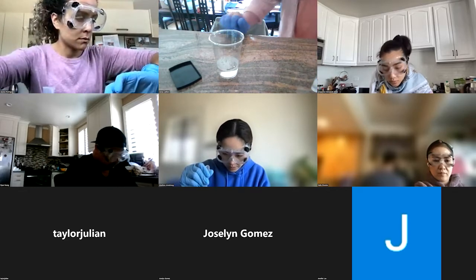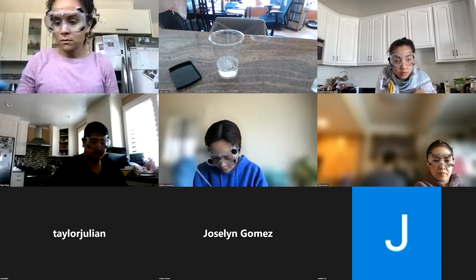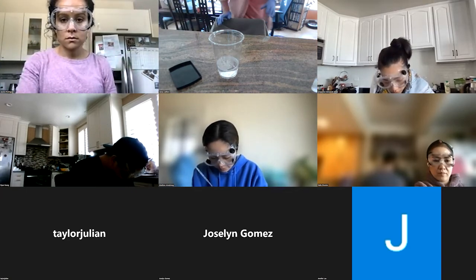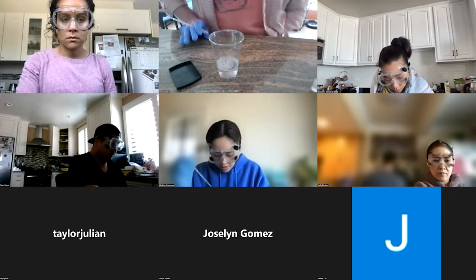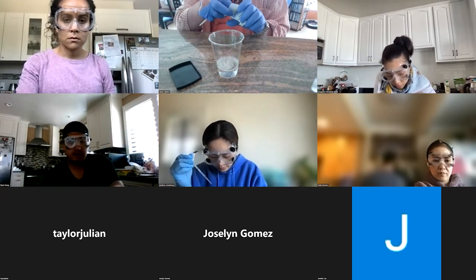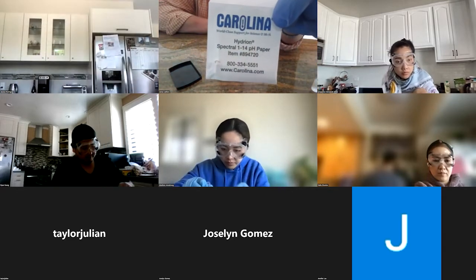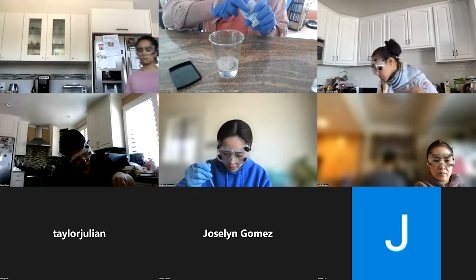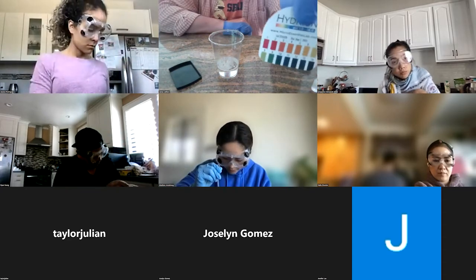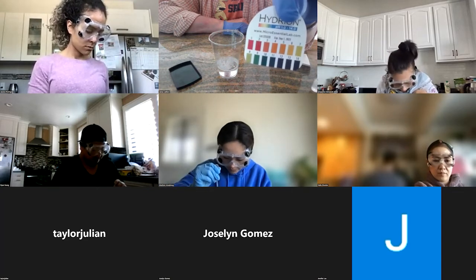So first thing I want to check is the pH. Like I said, my glass stirring rod was broken, so very sad. So here's the pH strips we're going to be using. It comes with a nice little colored guide to let you know what we should be looking for.